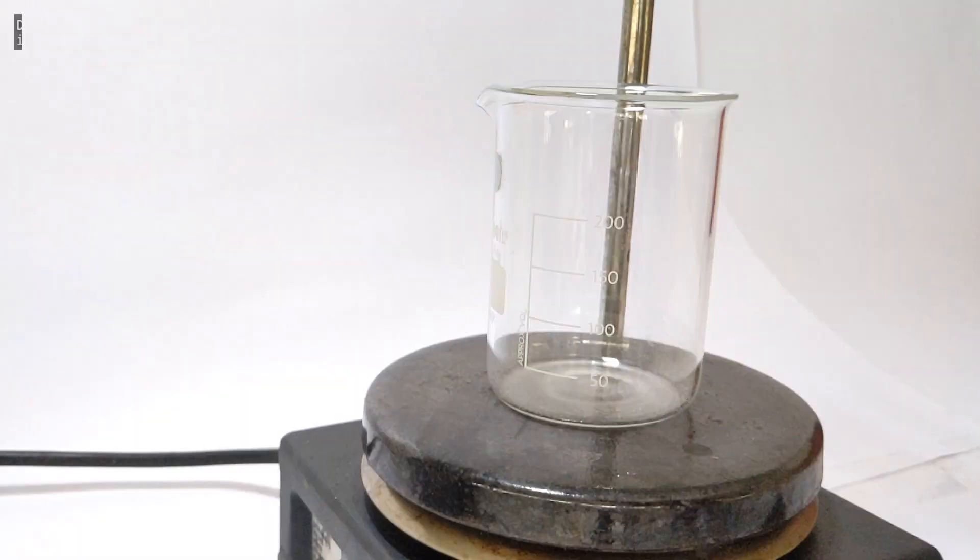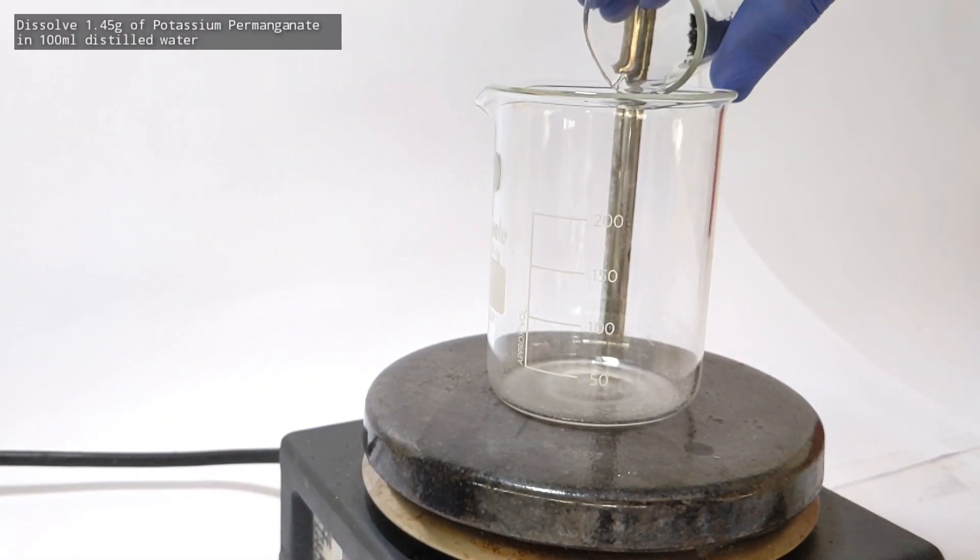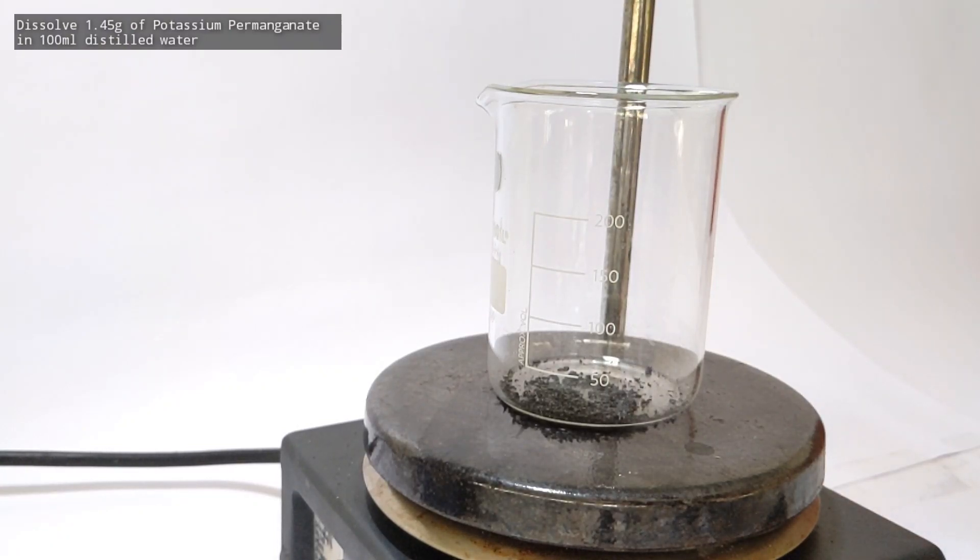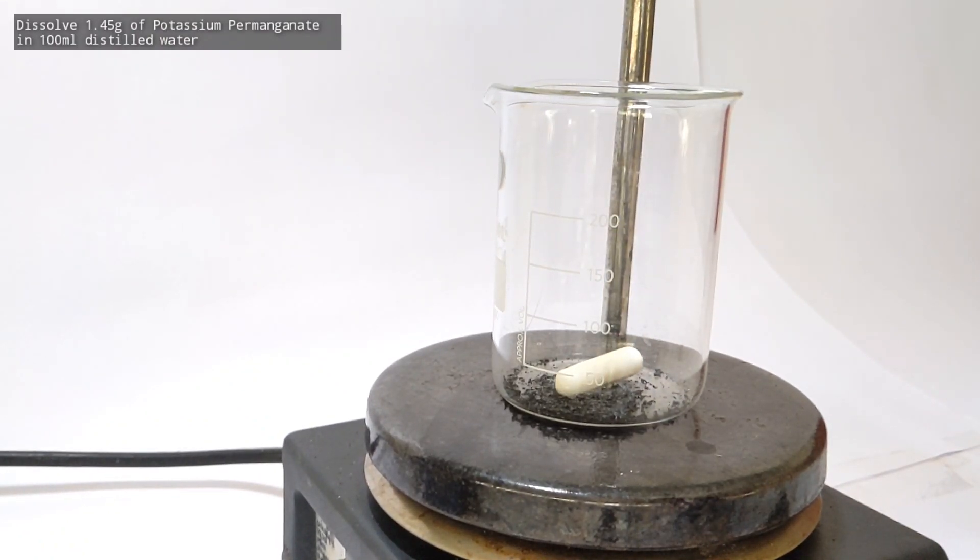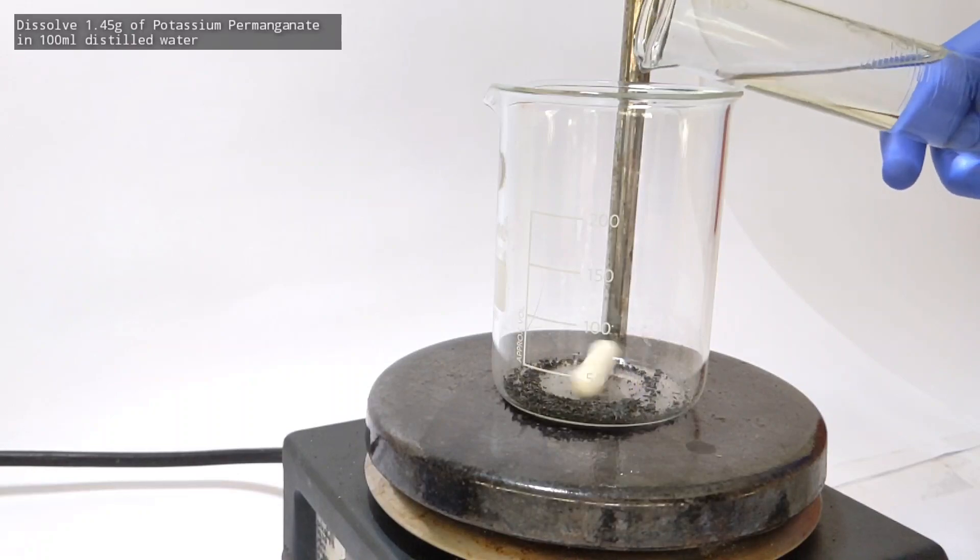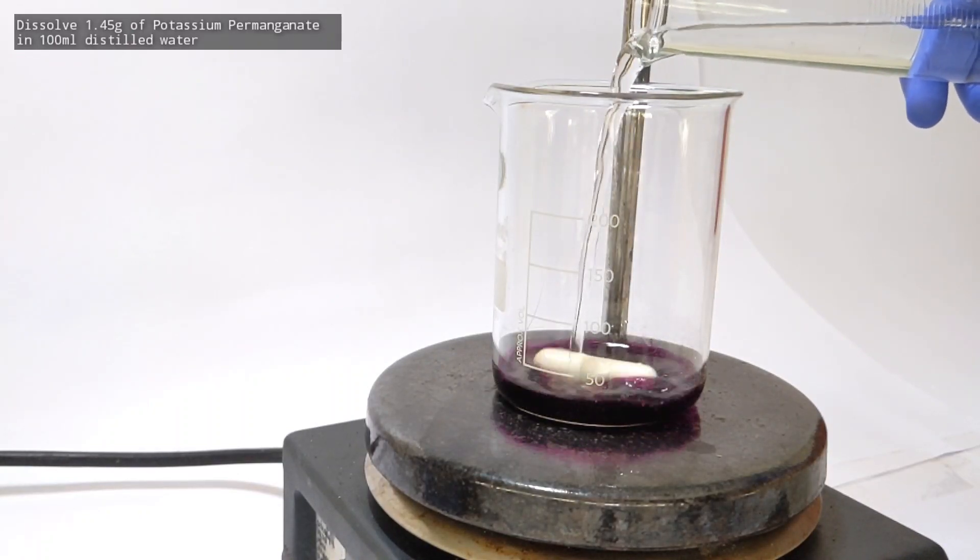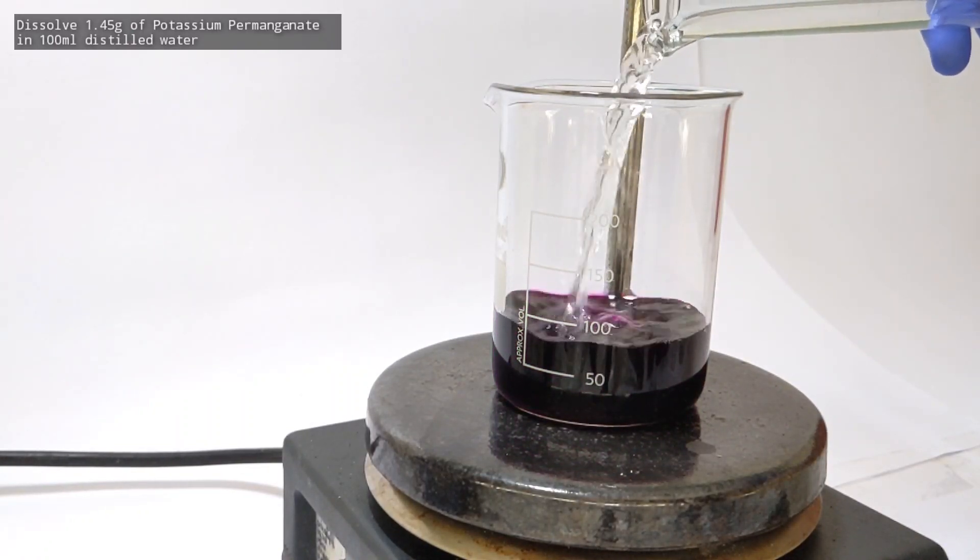Now we have to dissolve the potassium permanganate. Transfer it to the 250 milliliter beaker which is placed on a hot plate stirrer. A stirring bar was added and then with stirring, 100 milliliters of distilled water was added to dissolve the compound. The solution acquires a very dark purple color. We have to continue stirring for a longer duration.